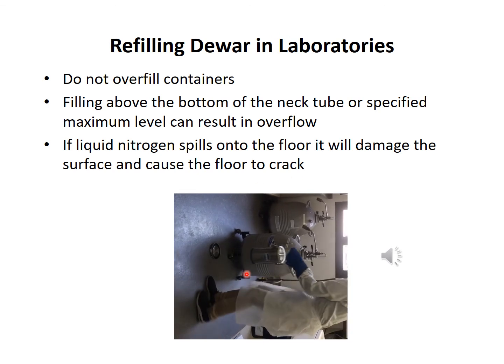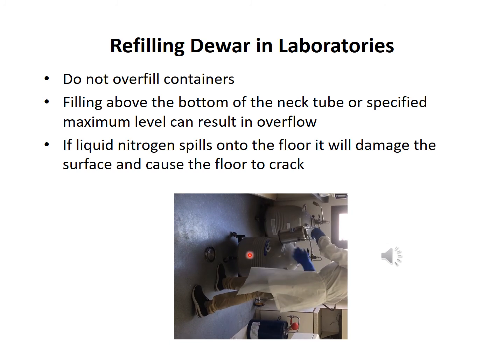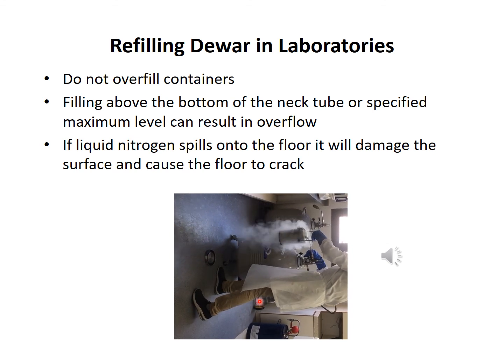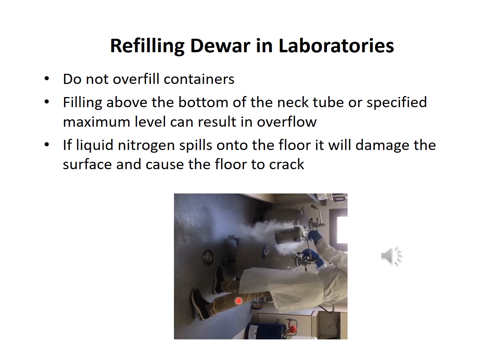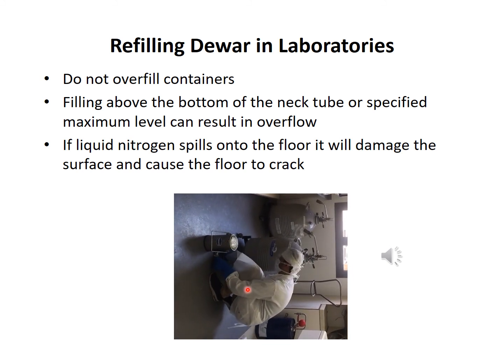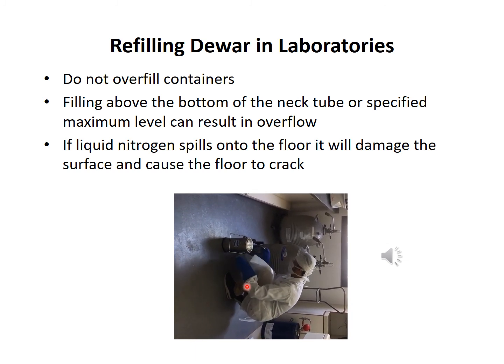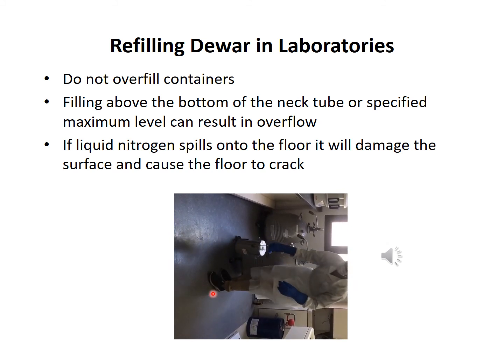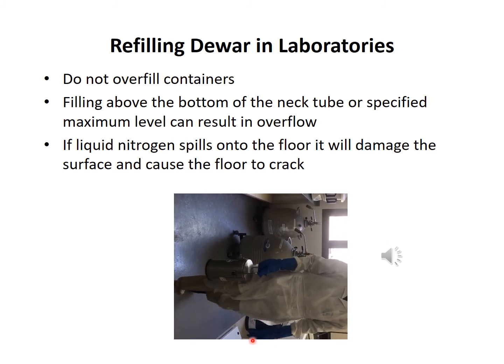Here you can see how this student is going to transfer liquid nitrogen from the Dewar to the small bucket. Care should be taken not to overfill this container. Sometimes overflow happens, and then liquid nitrogen can spread into that area. If the liquid nitrogen spills onto the surface, it can damage it because the temperature is very low, and it can also cause the floor to crack. So this is really very important.